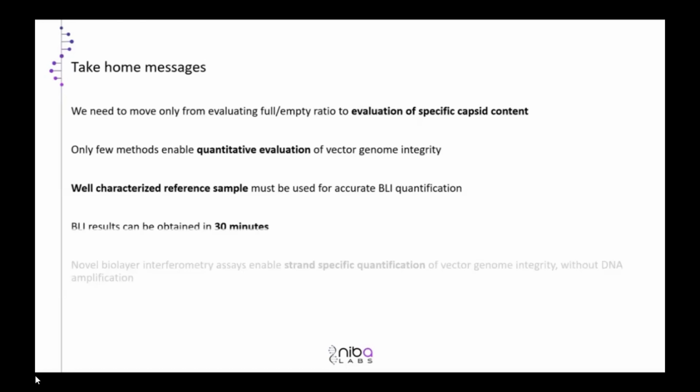BLI results can be obtained in a very short time, at least compared to other methods. And this novel assay can actually enable strand-specific quantification, which is not possible with PCR. Also for the vector genome integrity, and this is done without DNA amplification.